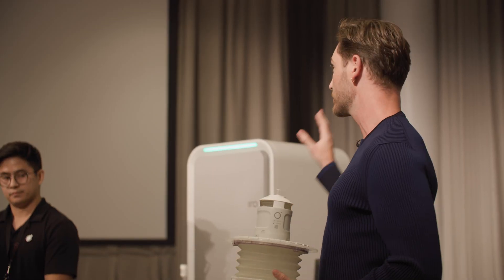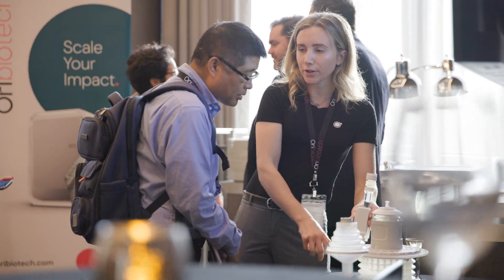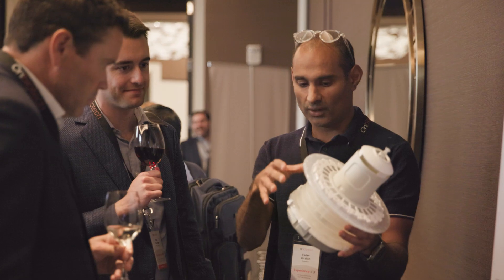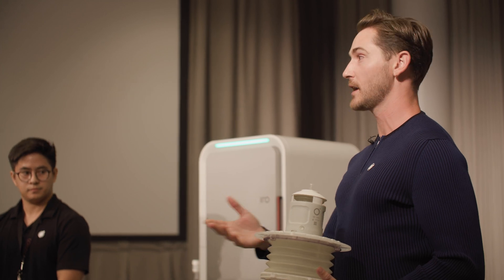If anyone is interested in getting this deployed to their labs — touch, feel, experience it in your space — we're more than happy to do that. The process is very simple. We want to empower you to ensure that not only does the biology work in our hands, it actually delivers the results that you're looking for in yours.